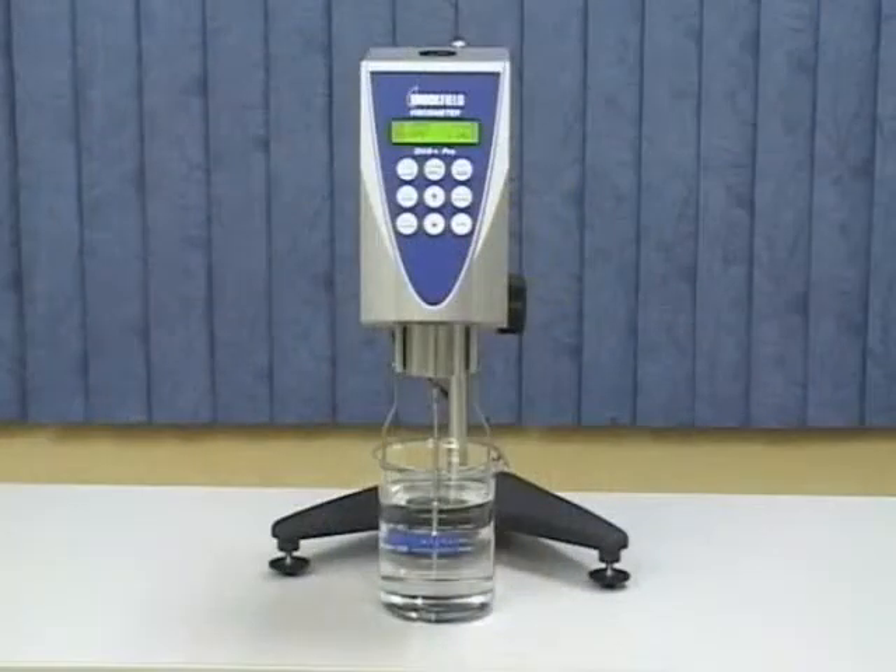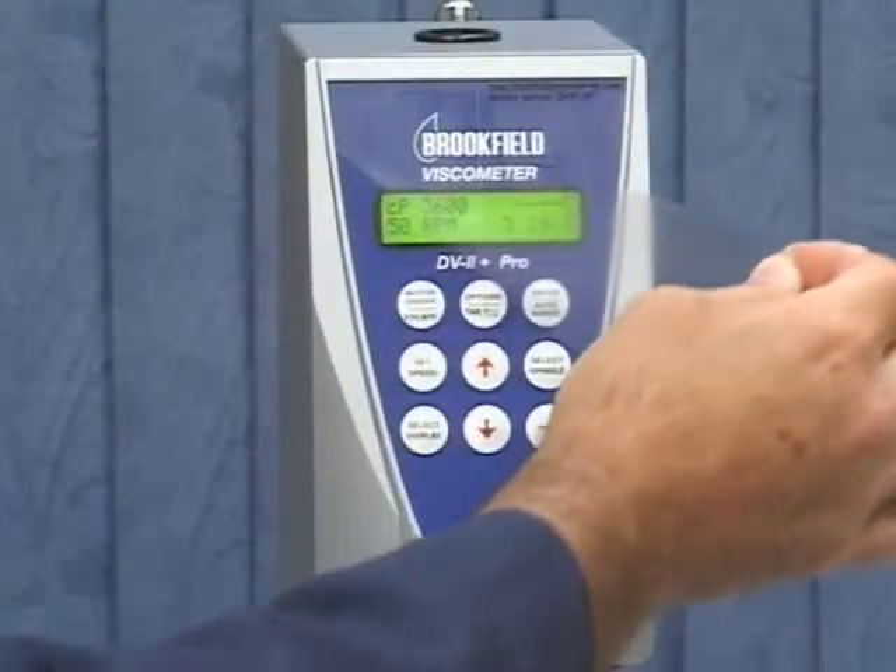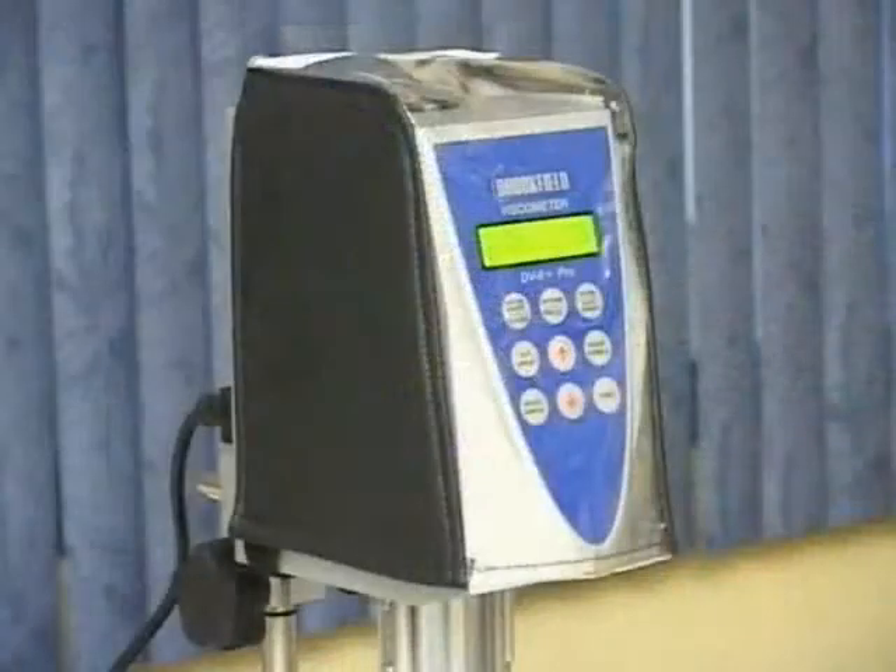Proper care of your instrument involves keeping it clean and protecting it appropriately, depending on the work environment. Brookfield provides accessory items such as the disposable keypad cover and the protective dust cover for the viscometer head.